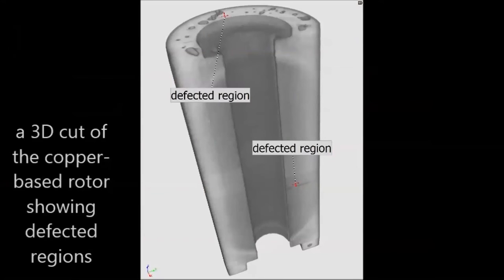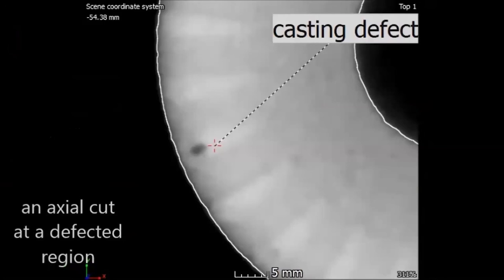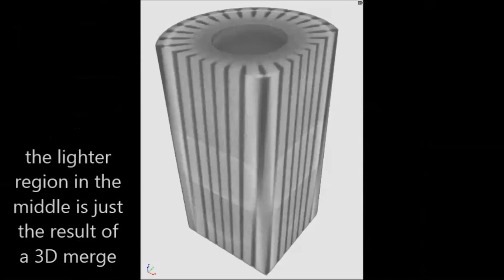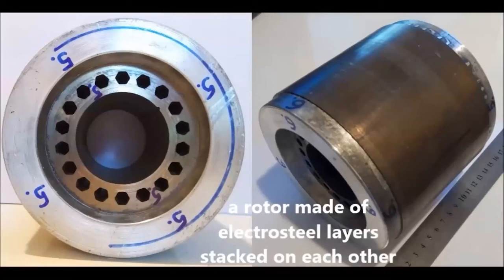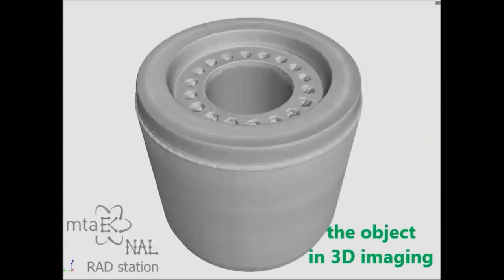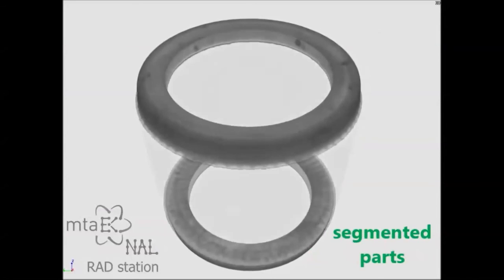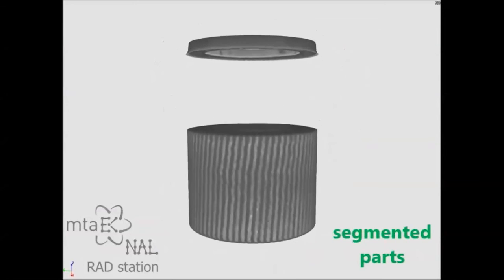and this time we used not low energy neutrons, but medium energy neutrons. They have higher penetration power, so even such bulky objects can be transilluminated, but at the same time the resolution is somewhat worse. So we can always select the adequate neutron energy range for the given problem, because from milli electron volt to mega electron volt, we have neutrons available.